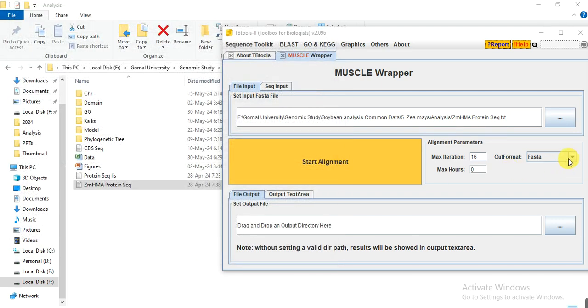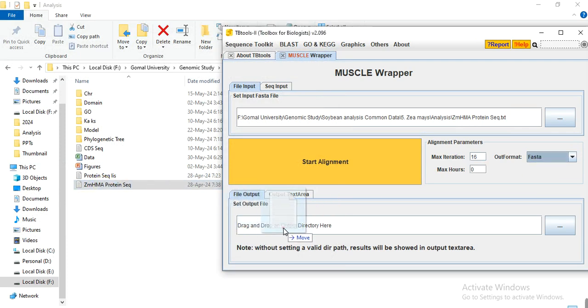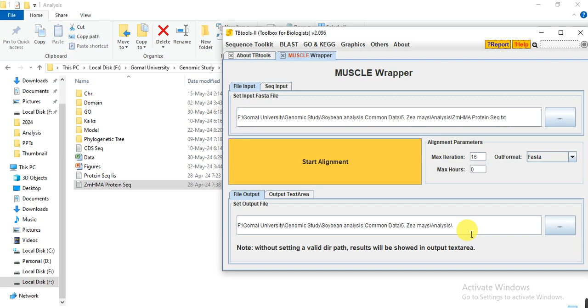Here select the Faster option, and here give the output path where you want to save the alignment result. Then write the file name alignment.txt and then click on Start.